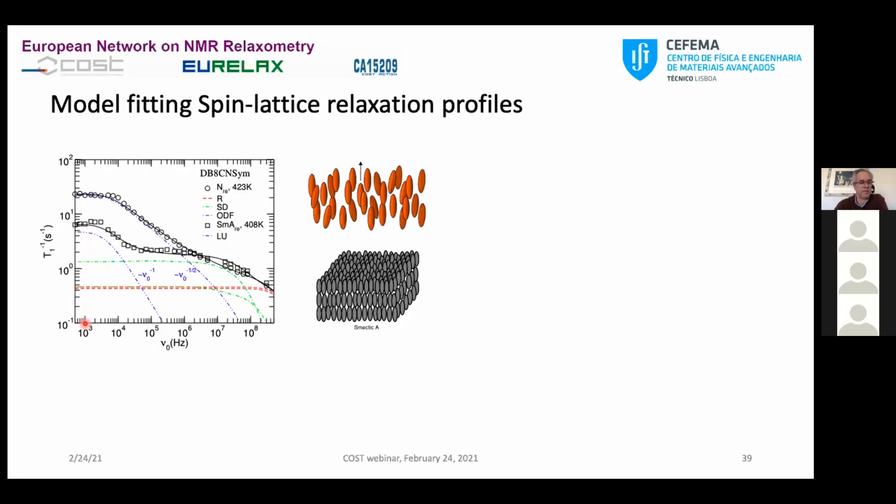The earth field was very well controlled. The earth field was very well compensated, and it was possible to really nicely control the switching down of the field, just to prevent spurious misalignment of the field and all that, so to keep the transitions adiabatic. And it was possible to see that there were some peculiar features in this low frequency part.